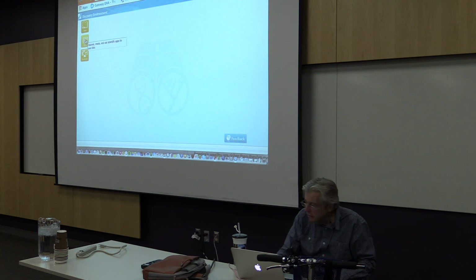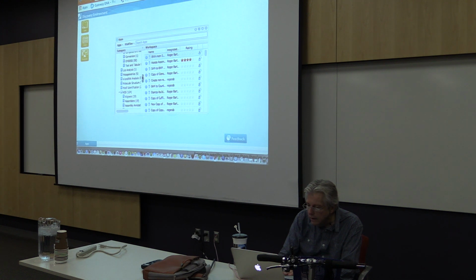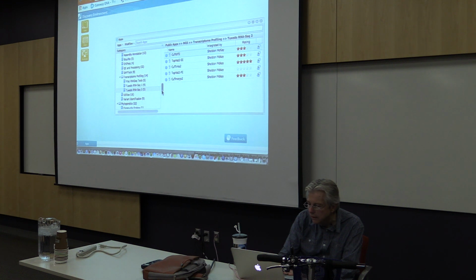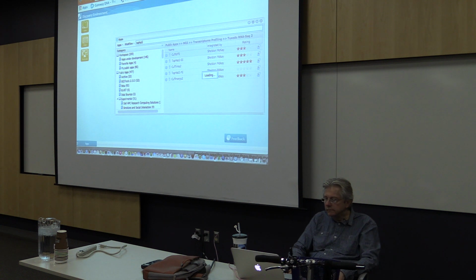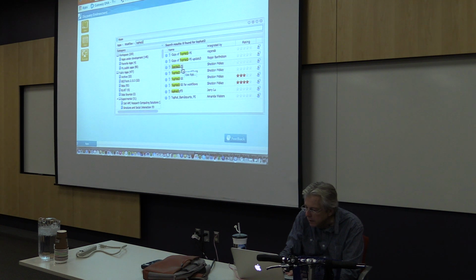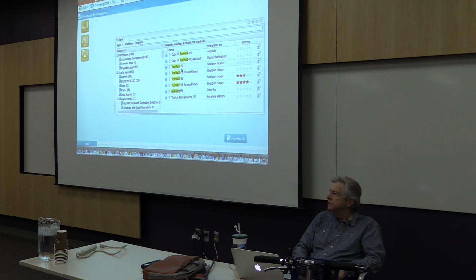And as I was saying, the apps, and if you go down to under next-gen sequencing, NGS, transcriptome profiling, Tuxedo RNA-seq 2, you'll see all the applications. But you don't have to go through all that. If you know that your first step is to use TopHat 2, well, just type in TopHat 2. And these are the applications, and TopHat paired end, that's what that PE stands for. Paired end, I guess I didn't entirely finish that thought.